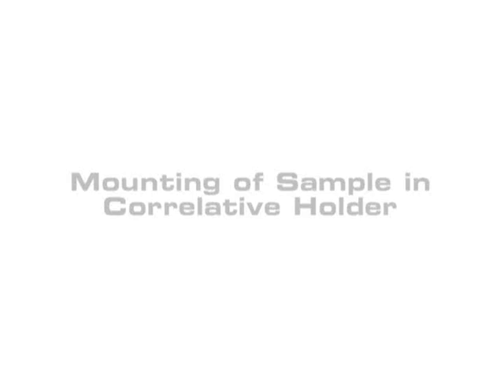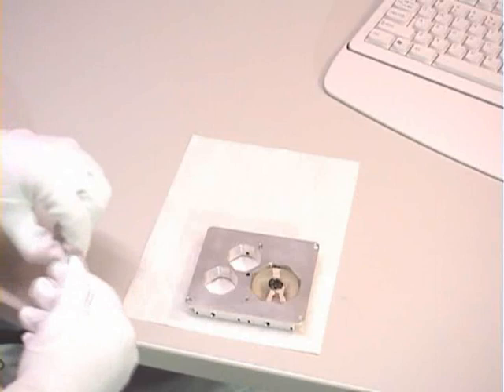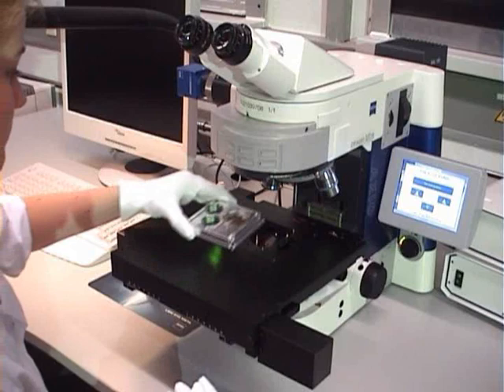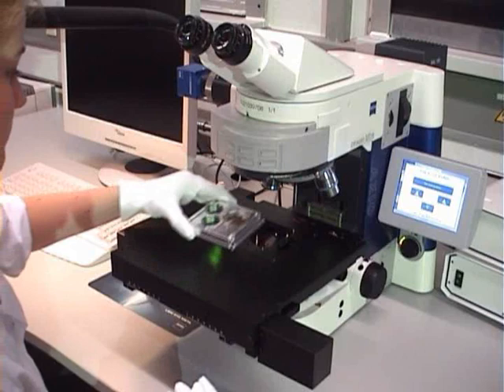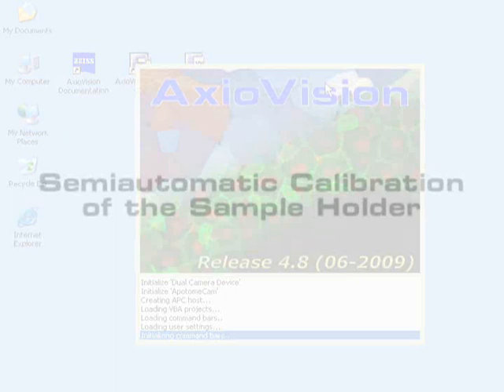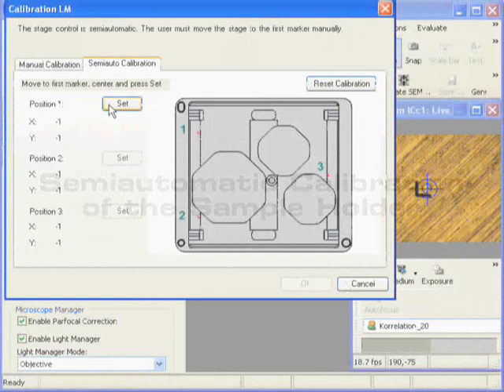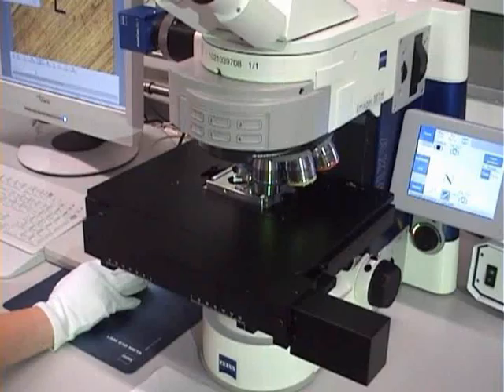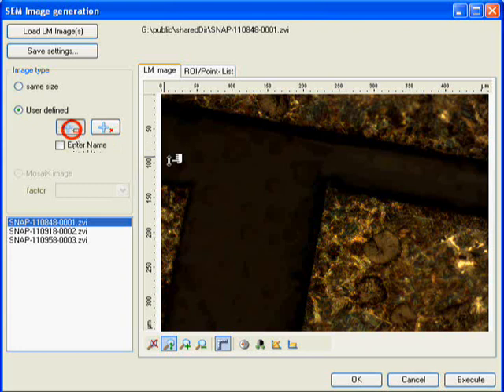Using Shuttle and Find is as easy as 1-2-3. Different sized samples are placed in a specially designed holder. The holder is then affixed to the motorized stage of any Carl Zeiss light microscope, controlled by the AxioVision software. This is followed by the semi-automatic calibration of the sample holder using three specially formed markers on its surface. The sample is now ready for observation, and the coordinates are saved within each image, meaning you only have to calibrate once.